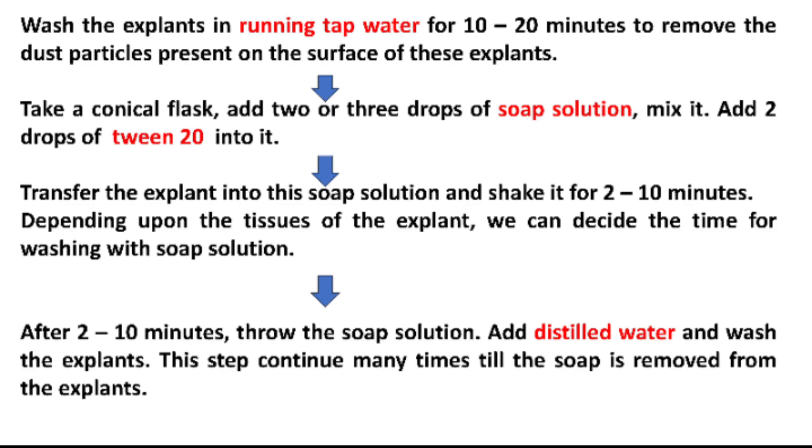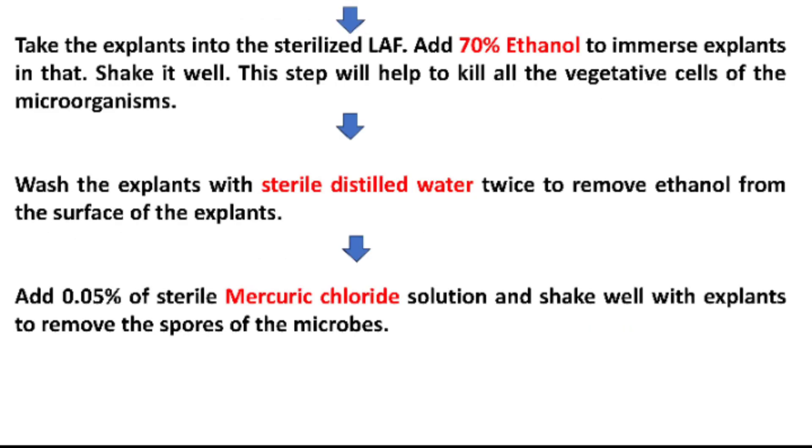Get the explants into the sterilized LAF. Add 70% ethanol to immerse the explants and shake it well. This step will help to kill all the vegetative cells of the microorganisms. Then wash the explants with sterile distilled water twice to remove ethanol from the surface of the explant.